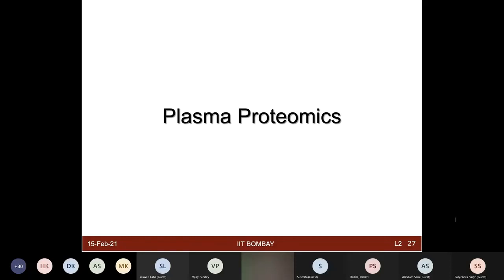So let me just try to conclude this session right now, where I started discussing the need for thinking about experimental design, as well as various types of strategies in which you can prepare your sample very well, looking at the questions which you want to address. Every type of sample is going to pose different types of challenges. And we showed you some demo, some idea for taking a tissue sample and how to process that, with the urea lysis method, or you can use the Trizol extraction method.